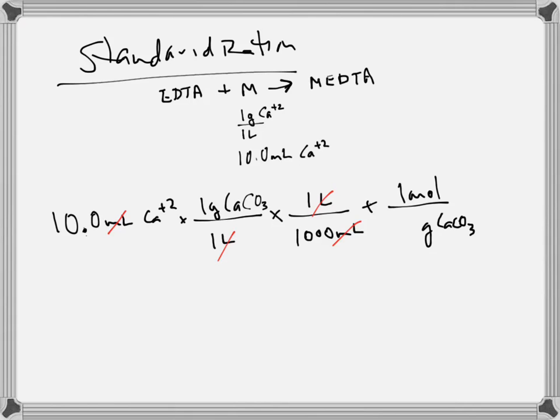Anybody have that calculated or in their pre-lab? 100? 100 works for me. Okay. What's the relationship of calcium carbonate to EDTA? Do we have that relationship? Kind of, sort of. Does our balanced equation say calcium carbonate? No, it just says calcium ion.